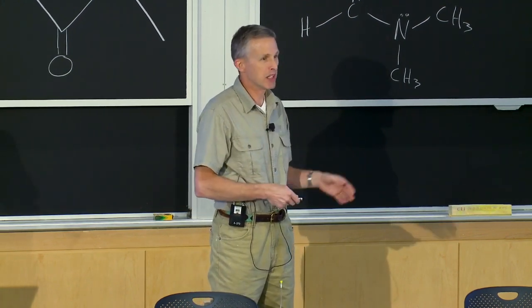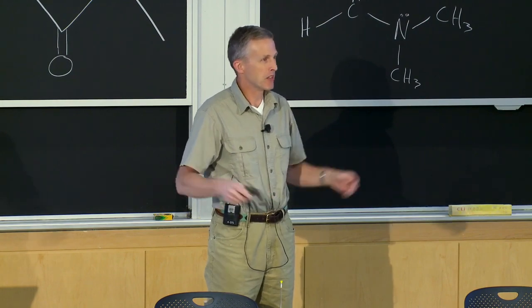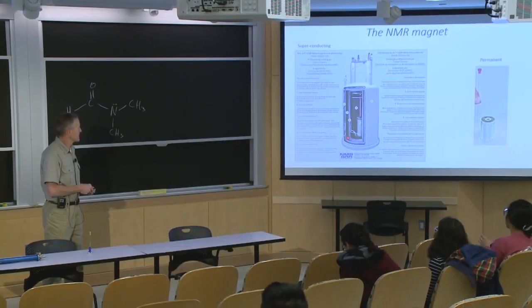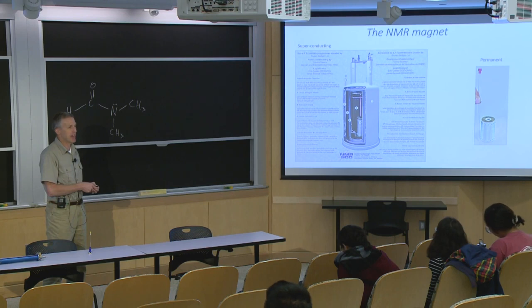So if you just had liquid helium touching metal, the outside of that metal would be a big chunk of ice. So this has a portion of it that's evacuated with a high vacuum to provide insulation.